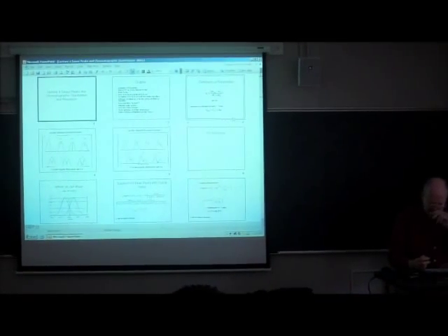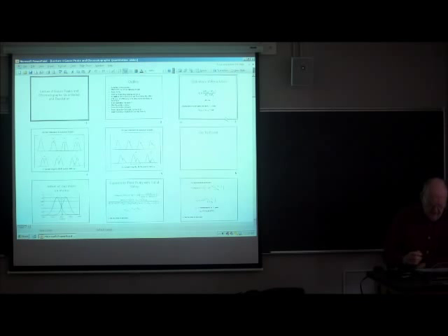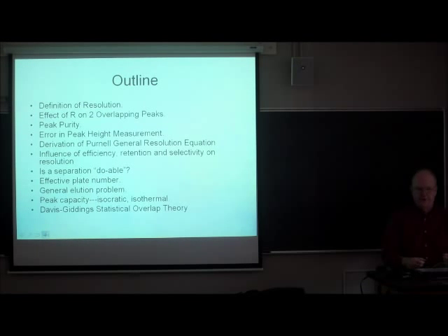Today, we're finally gonna get to some bottom line analytical types of things, all related to resolution. So the emphasis today is now on two peaks that are not completely decoupled from one another, which is, of course, the simplest situation that you ever run into, because normally you're dealing with a significant number of peaks, and so you actually have to worry about clusters of something coming in on both sides of a particular peak. But two is a good place to start.